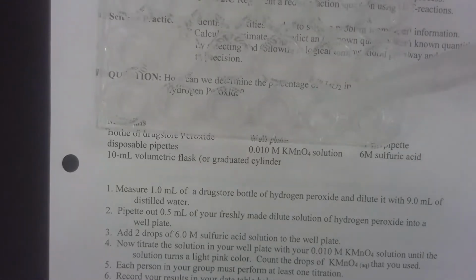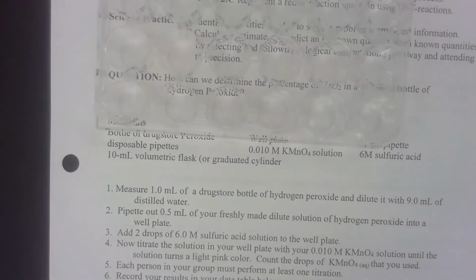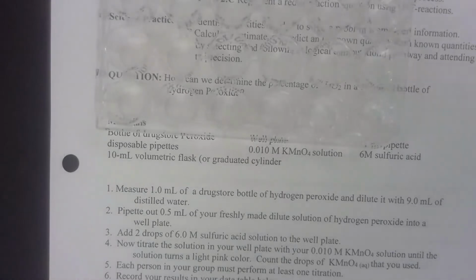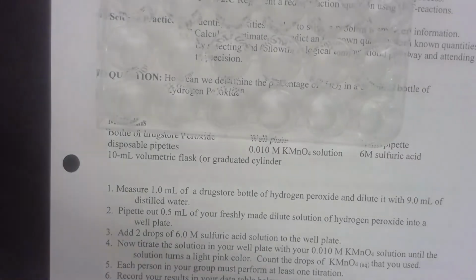There's 2. And there is, let me do that again. I wasn't sure I got exactly 0.5. An air bubble in there. And there is 3. Okay, so I'm going to do this 3 times.